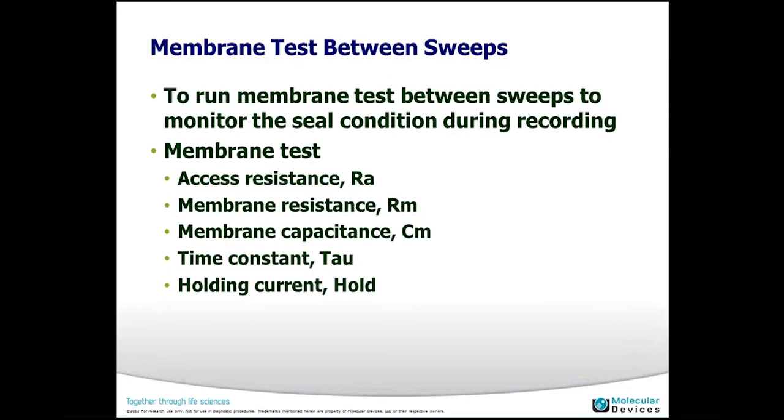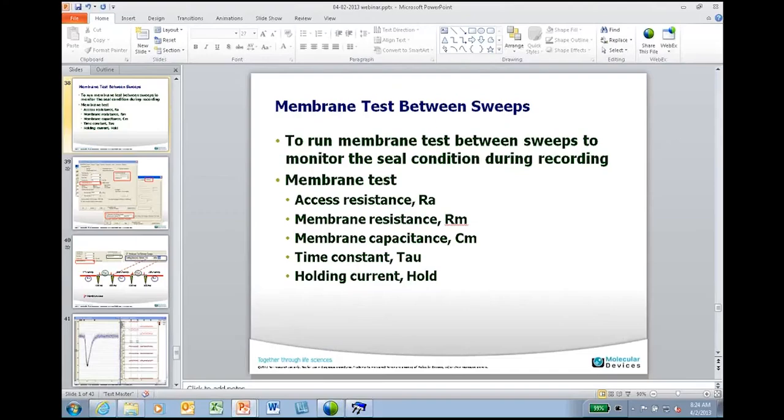So I think I've run out of time, so I would like to switch. I will skip this one and go to the live demonstration to show you how to use the statistic and the user list, and also the sequencing key. All right.